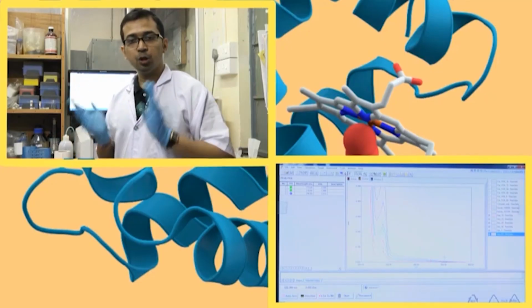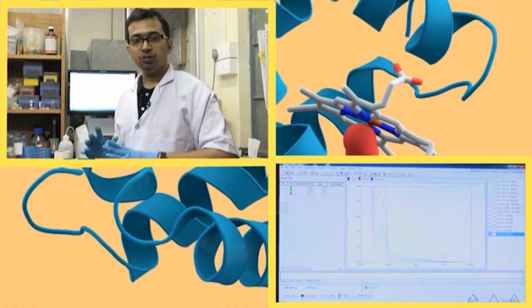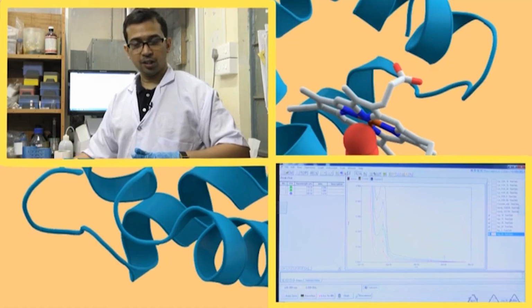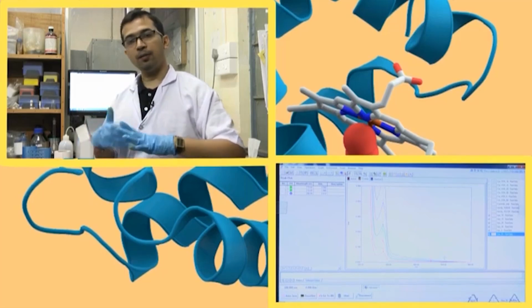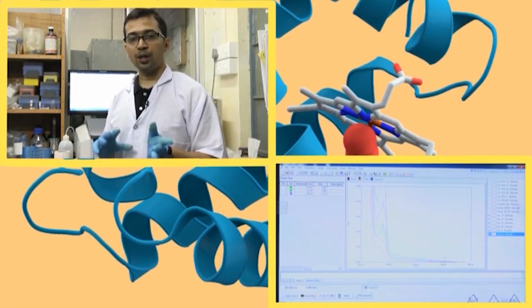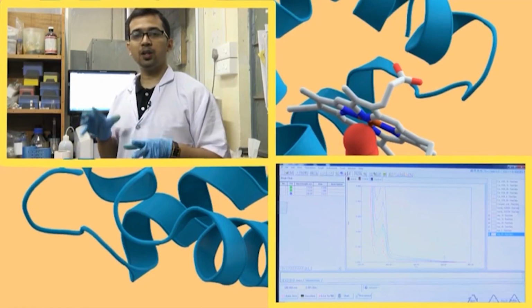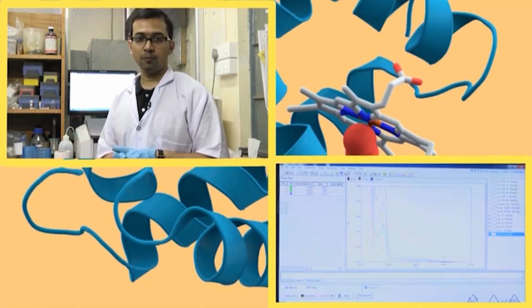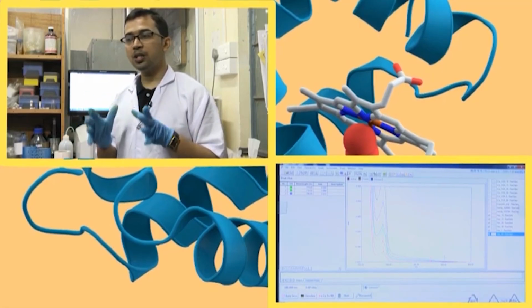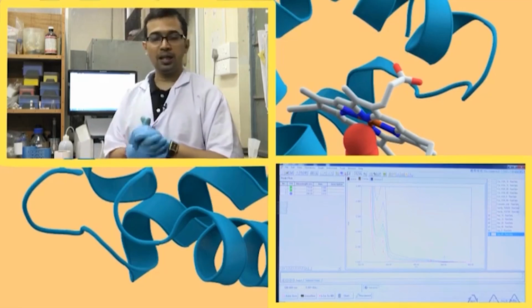In the x axis we will be taking 1 by concentration of HSA, because you are increasing the concentration of HSA. So, with increasing concentration of HSA, you have to plot how the reciprocal of the change in absorbance varies, and from that plot, with a bit of calculation, you can get the binding affinity value. We can use this to quantitatively estimate the protein ligand binding.